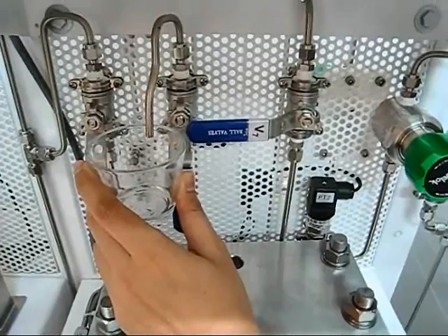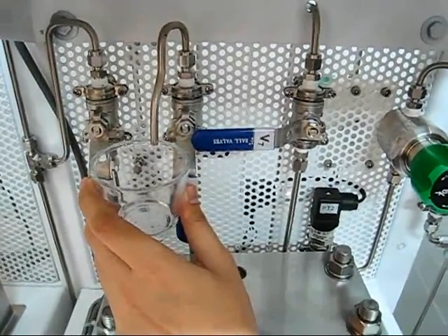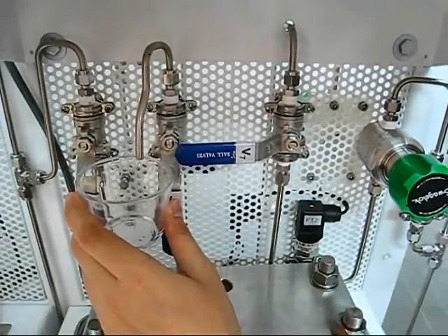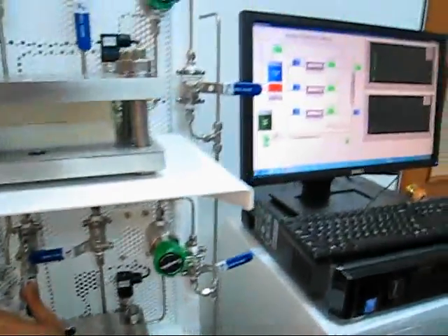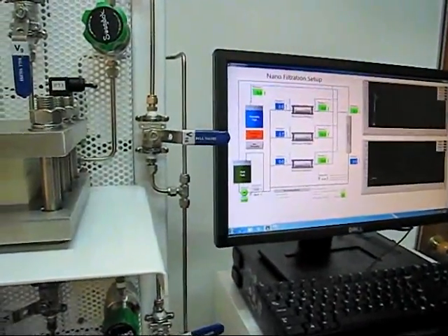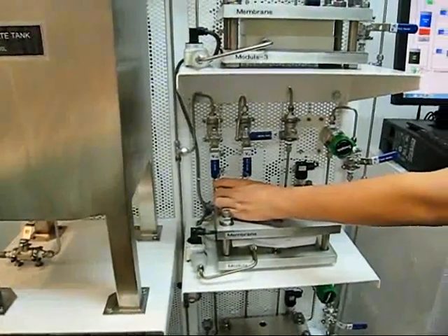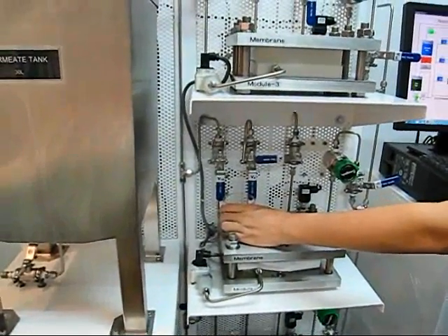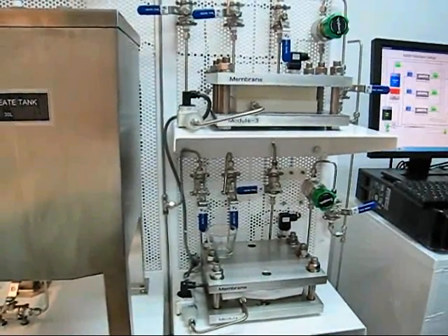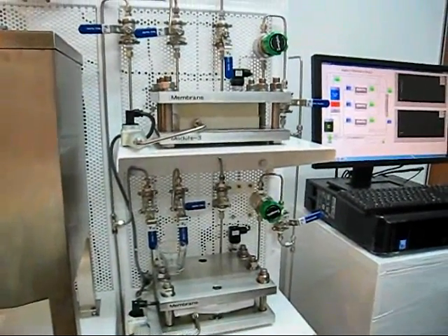I will stop my demo here. The last run we collected quite a bit after about maybe 20 or 30 minutes of permeate. This is typically how we will run an experiment to engage the flow and engage the pressure properly. I hope this is sufficient to get you started off. Happy playing with the system, and I would love to answer any of your questions if you have any. Please let me know. Thank you. See you.